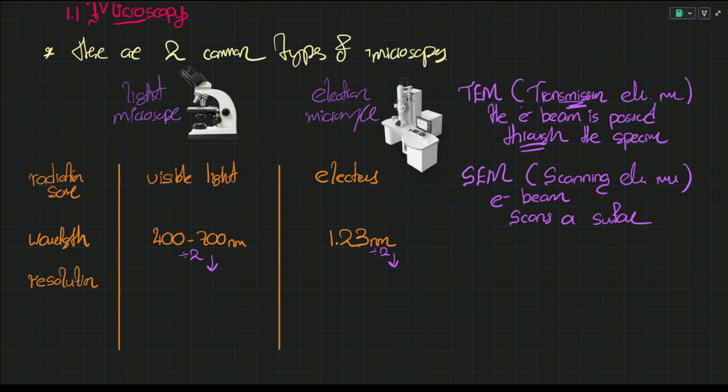So roughly I'll just take 400, and so typically we say that the resolution, it has a specific name, a specific definition, I'll be talking about that, but simply 1/2 of the wavelength. So here that would be 200 nanometers.